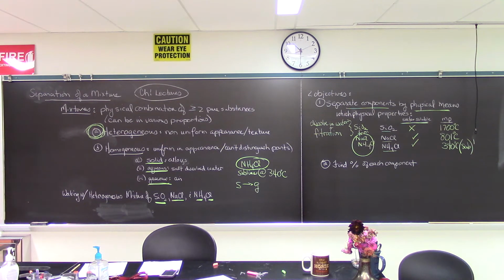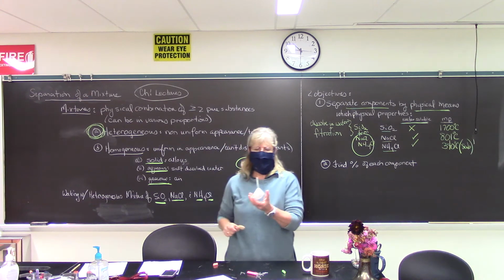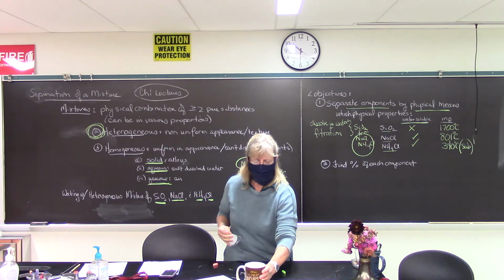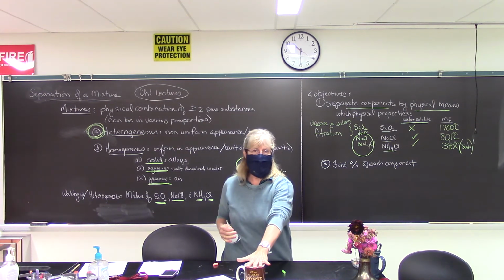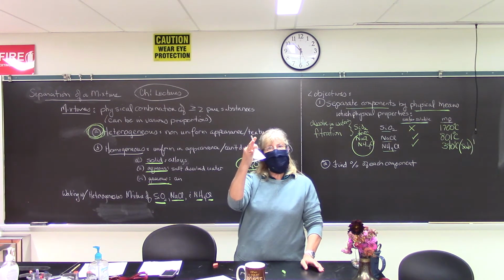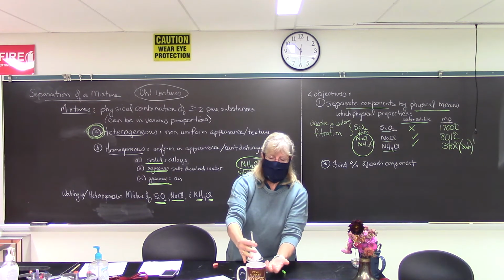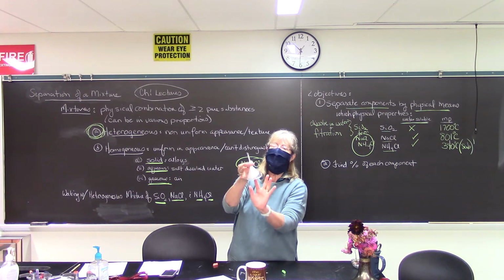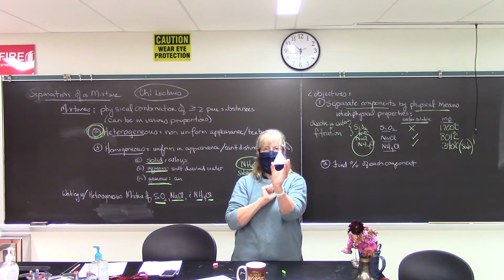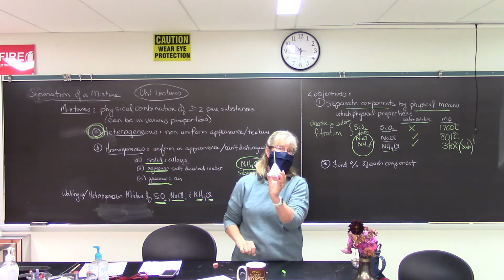Yesterday, our photographer and Mr. Proetta performed this experiment. They heated the mixture in a beaker, we're going to pretend that's a beaker, and put a funnel over the top. The funnel was considerably cooler than the beaker, so as the ammonium chloride sublimed, it hit this much cooler surface and deposited on it. So that's kind of cool. Some of it got up here and some of it ends up going out into the hood.